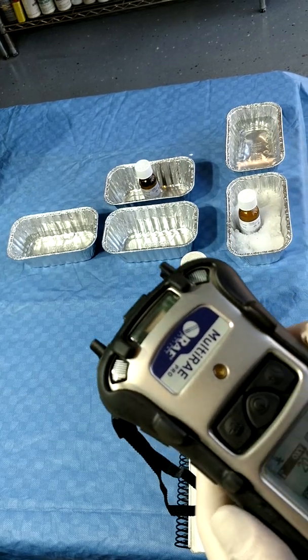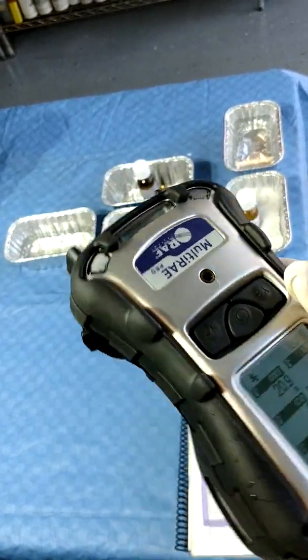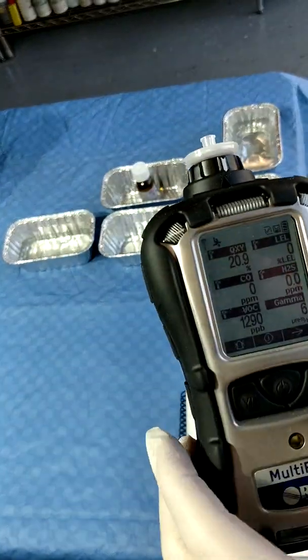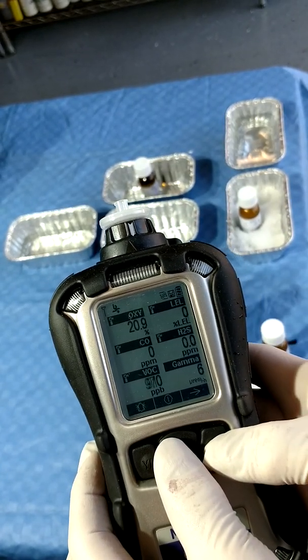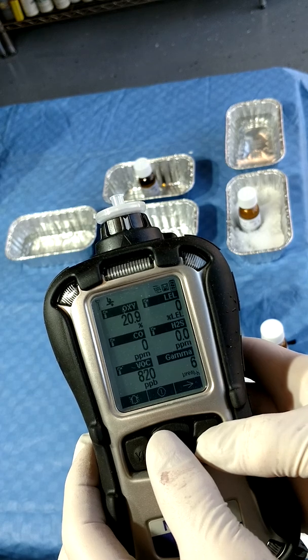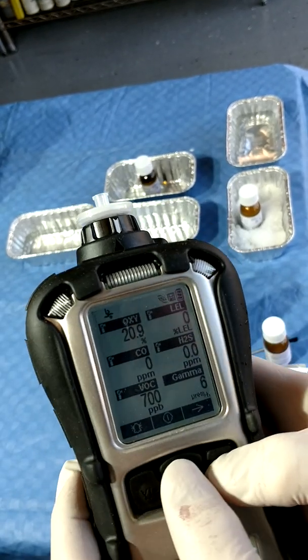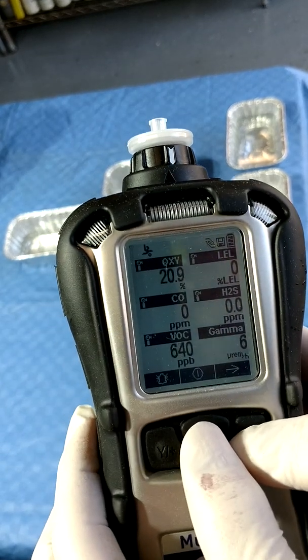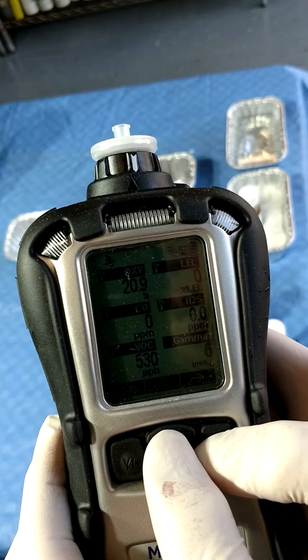However, using the onboard library, we can get corrected readings for the acid directly. Press the mode and the N key to get to the program menu.